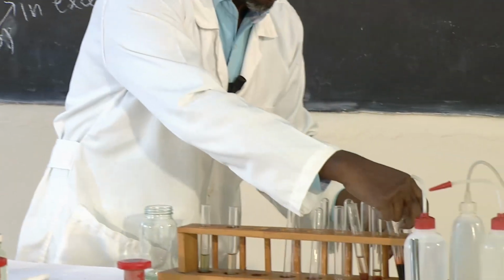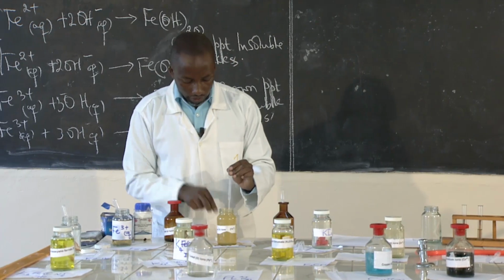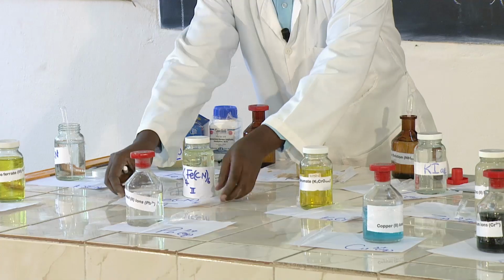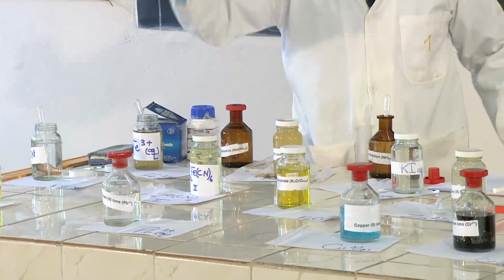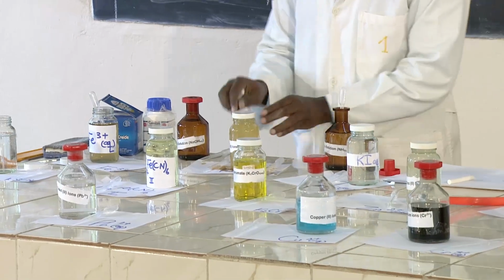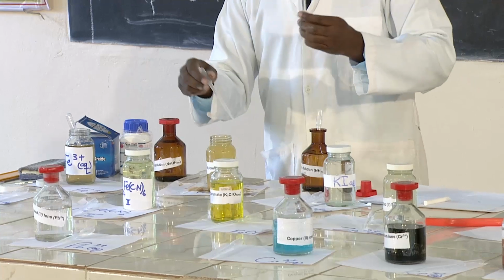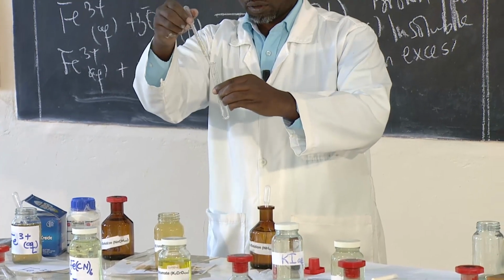Let's also carry out, we just see the effect with potassium hexacyanoferrate 2. Let's start with the iron 2. Also some few drops of iron 2.